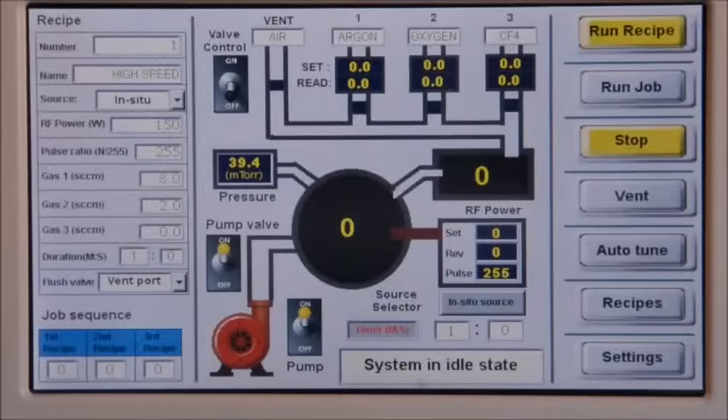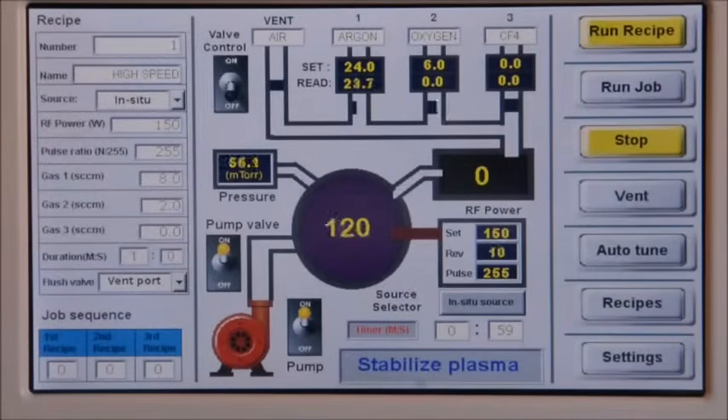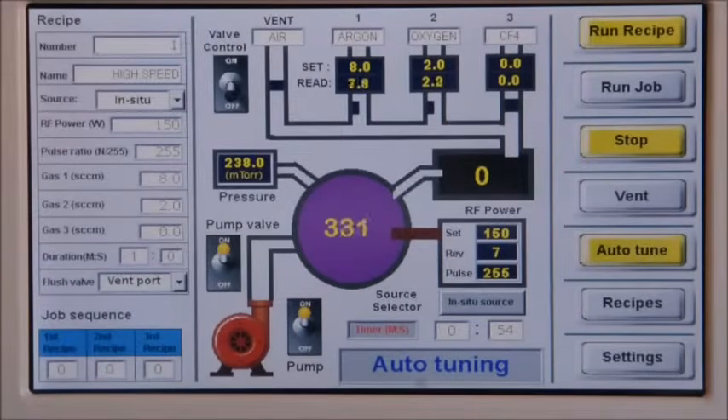Then click the run recipe button. Recipe execution will start automatically. First, the system will pump down the chamber if necessary. Once the chamber pressure reaches the starting point, the system will ignite the plasma, start gas flow, and stabilize the plasma.